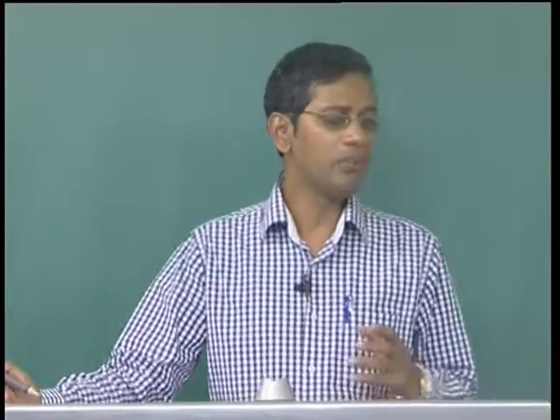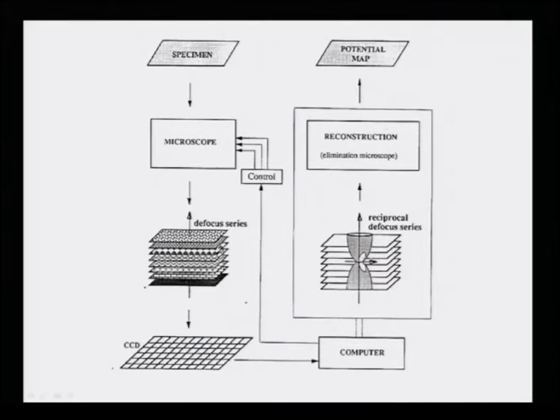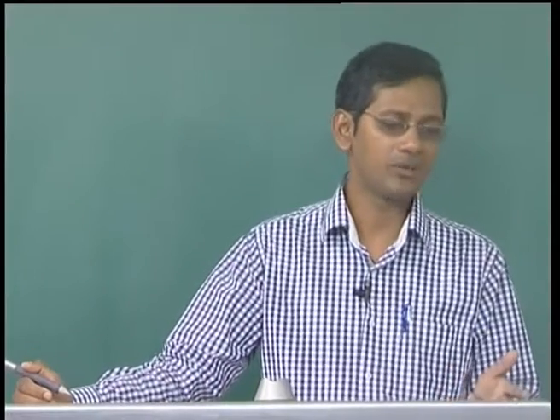An input to such a multi-slice method obviously has to contain different parameters of the specimen or the object, like the unit cell, the position of the atoms inside the unit cell, the thermal factor, the Debye-Waller factor, because of the vibration of the atoms as the temperature increases, and the orientation of the crystal or the object, as well as the thickness. So, this itself is not an easy simulation.